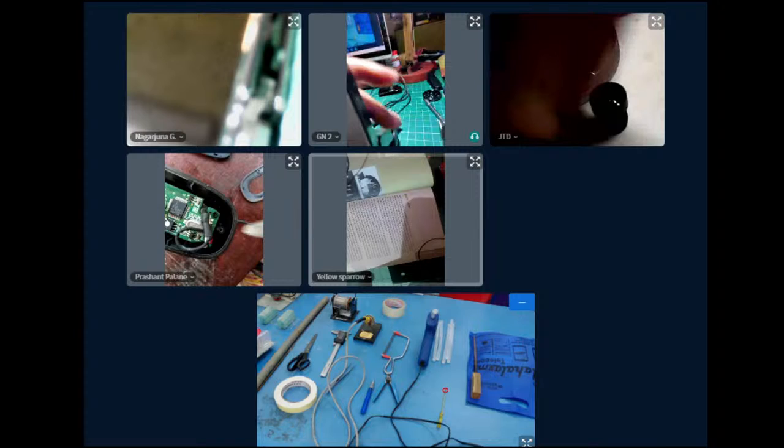Okay, so we are still in the stage of unpacking the web camera. We need to figure out what we will do so that it becomes a microscope. I think GN did complete it, right? No, he didn't yet. He just opened it and connected his web camera to his laptop. So the earlier images which we are seeing in the live feed were not from the inverted setup? No. They are from the live normal web camera.